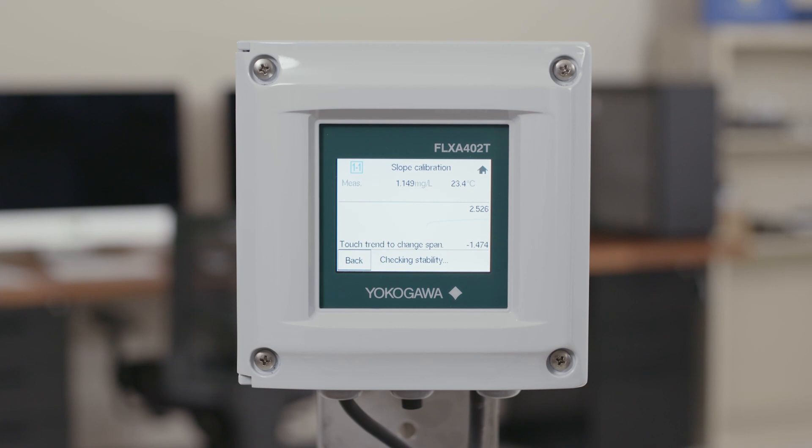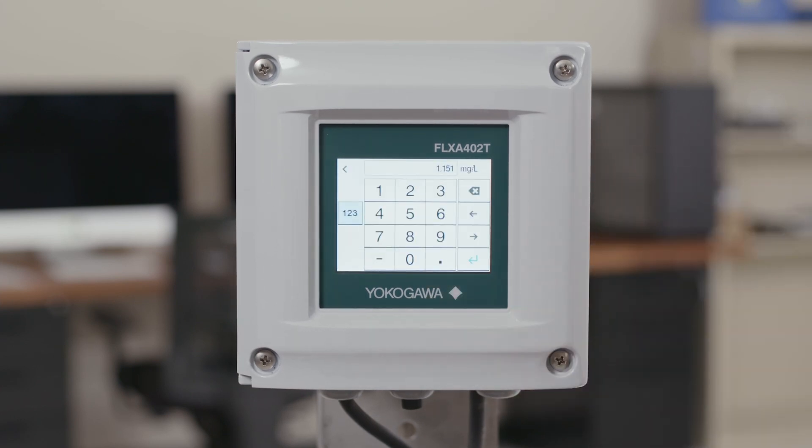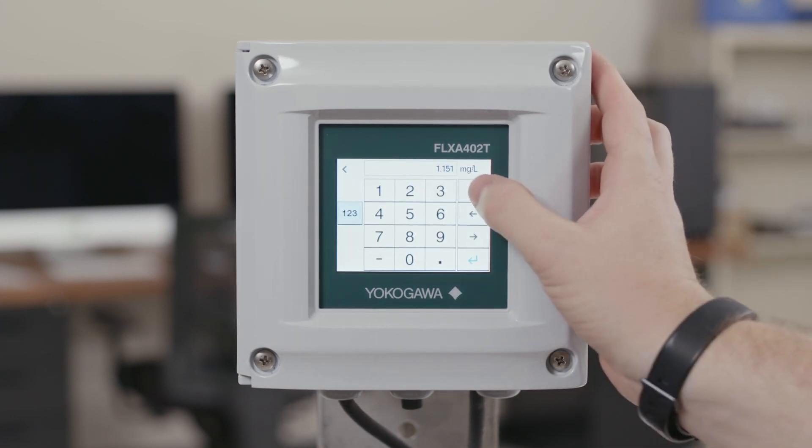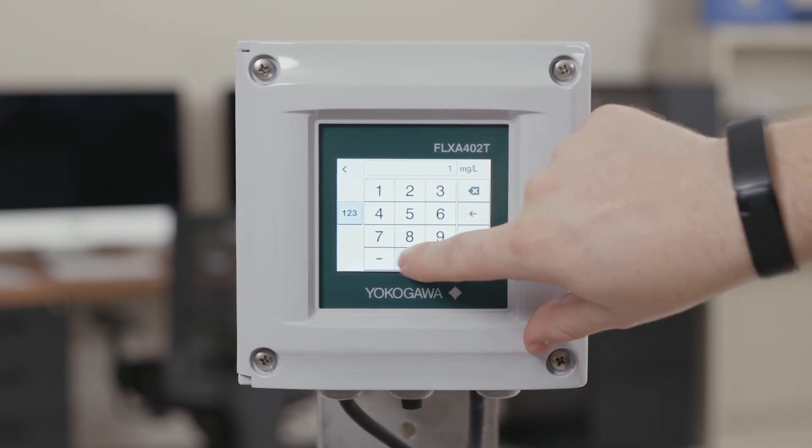This will allow the analyzer to make sure that you don't have any drastic changes in what you're measuring. If this is the case you'll see a next button appear and it will show your current reading and a cal point reading. In this cal point here you want to actually click on that and input what your handheld or your lab measurement was. This is your input of the actual value that it should be reading.